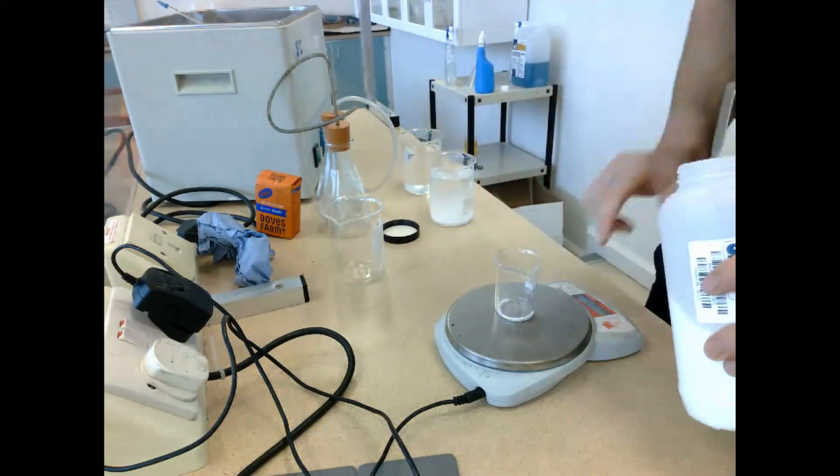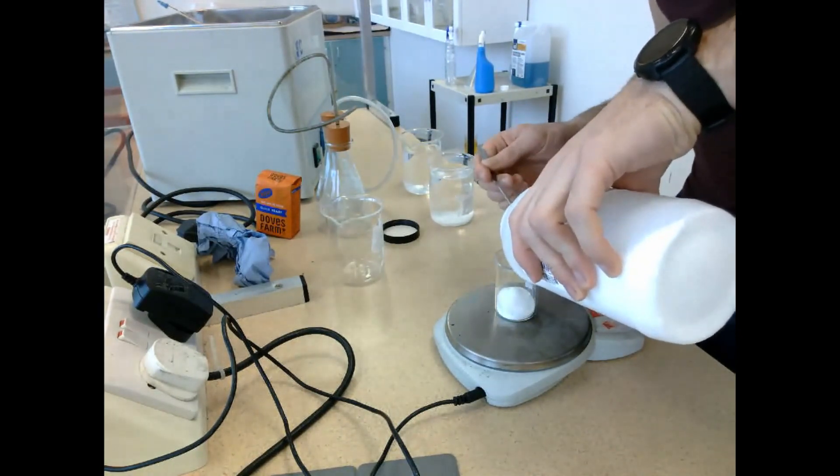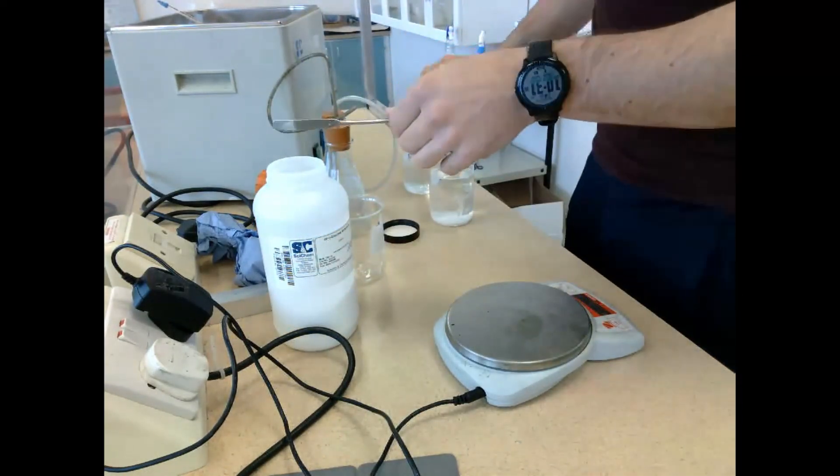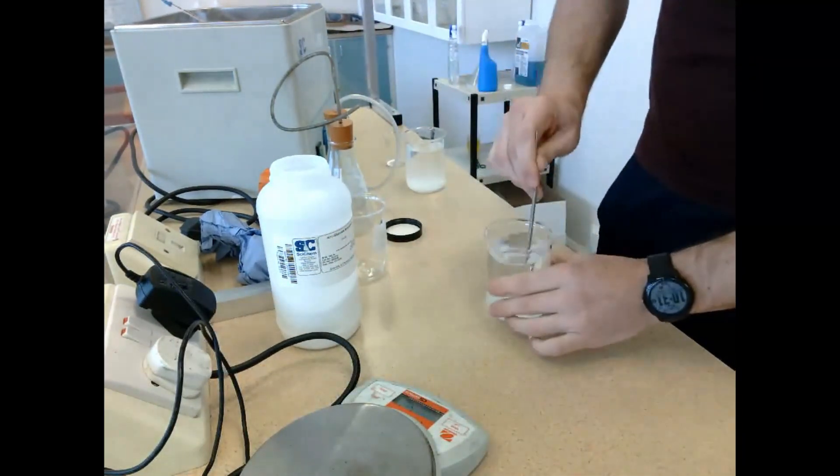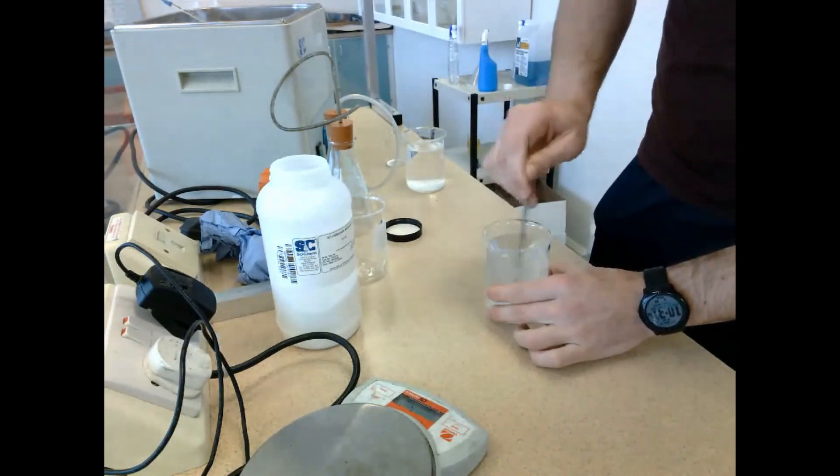We are then able to get to the next step, which is measuring out the glucose. We're going to weigh out about five grams worth of glucose and we're going to add it to the first beaker.